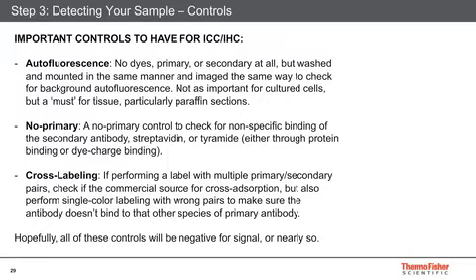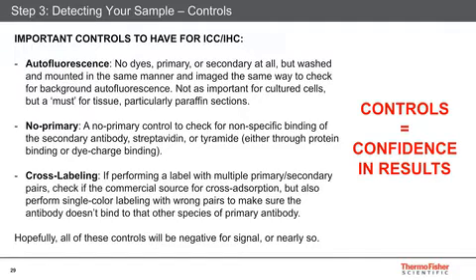But if you do, now you know that you have the possibility of cross-labeling, and vice versa for the other antibodies, an anti-mouse on the rabbit primary to see if there's any binding. Now hopefully all these controls will be negative. You won't see much signal at the exposure time that you need, but it's an important thing to check when you're first starting an assay. Remember, controls give you confidence in your results.